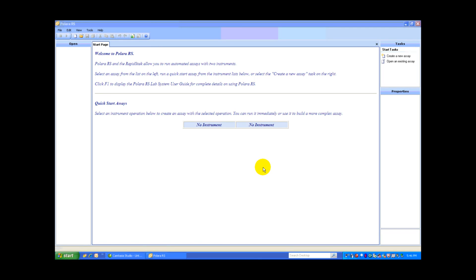The Thermo Scientific RapidStack Microplate Stacker is the perfect partner for the Thermo Scientific WellWash Versa. Today I'm going to illustrate how the two work together with Polara RS, our scheduling software.